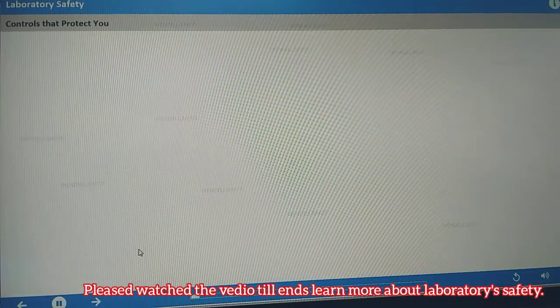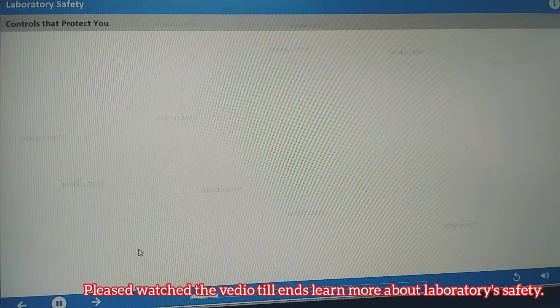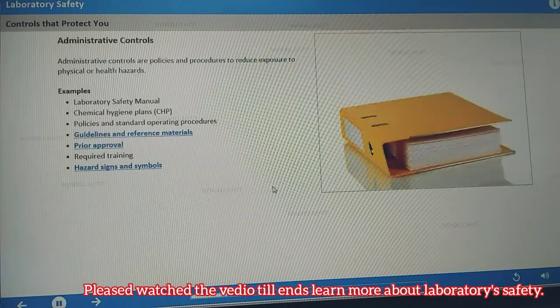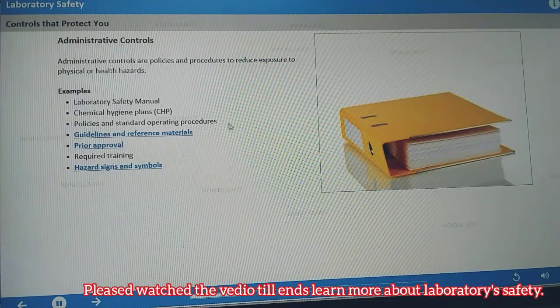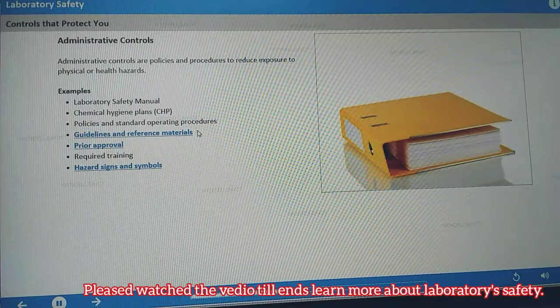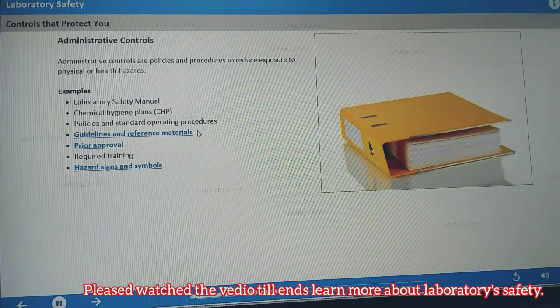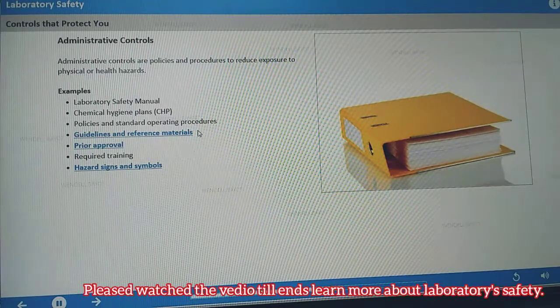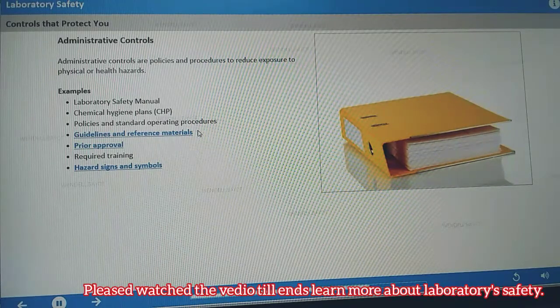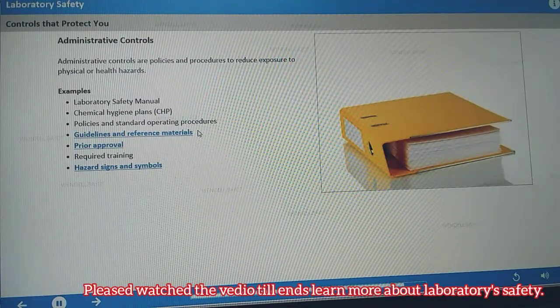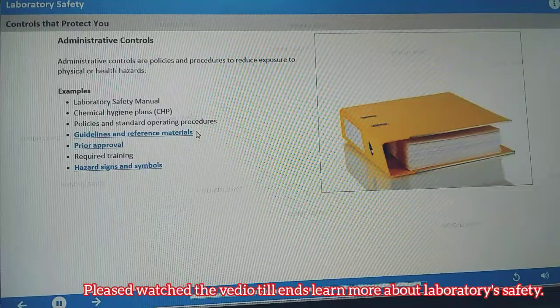Your laboratory has established a number of administrative controls for its operations. Administrative controls define the requirements for safe use of chemical, biohazard, and radioactive materials and provide the framework for determining the appropriate engineering and PPE controls. Administrative controls can be general policies or laboratory-specific standard operating procedures.